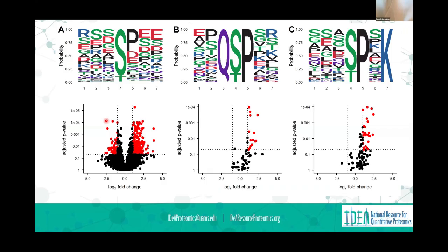The second one's a better example, that site, for B, that's a much smaller sample set, but all of those peptides had the recognition site of QSP. So, every one of those phosphorylations had a QSP, so that kinase is directed towards that site. So C is an indicator that it prefers the serine.